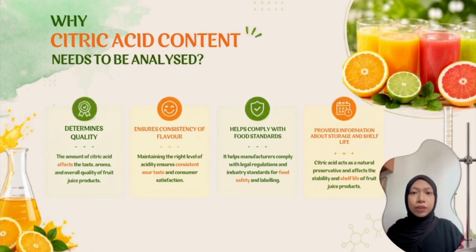Thirdly, it helps to comply with food standard, which is it helps manufacturers to comply with legal regulation and industry standard for food safety and labeling. Last but not least, it helps to provide information about storage and shelf life, which is citric acid acts as a natural preservative and will affect the stability and shelf life of fruit juice.